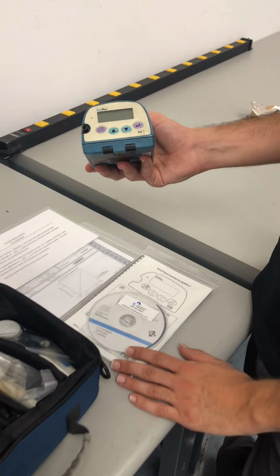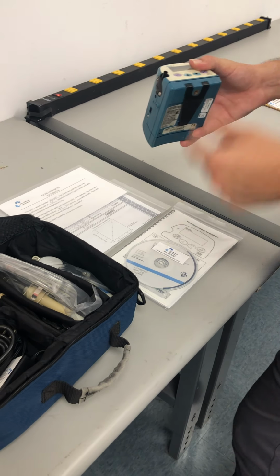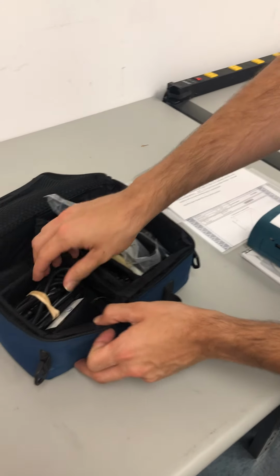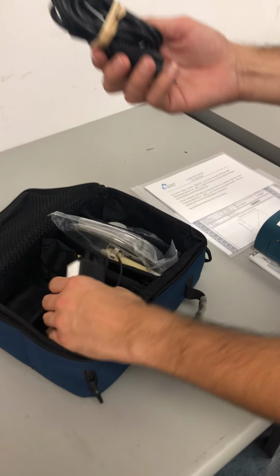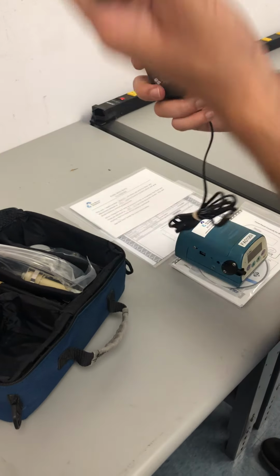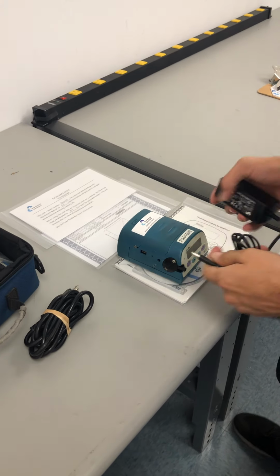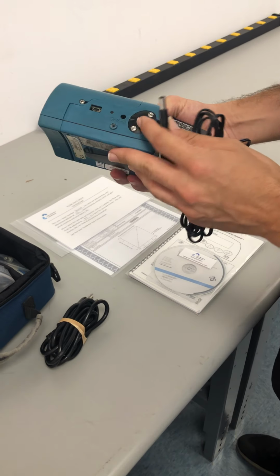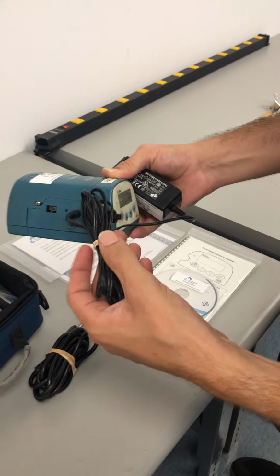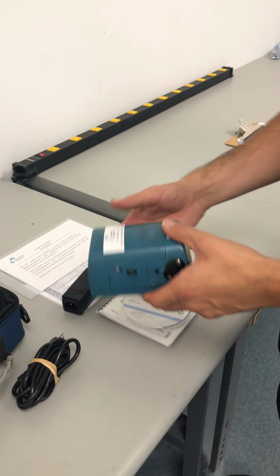What about charging? Okay, so, and also I'll show you how to do a zero calibration if need be. So charging, you have your AC adapter and line cord right in the unit here. Right, so it's just your classic AC line cord. It's got your outlet here, which will go in right behind the impactor. Got it. How will we know when to charge, or should we charge every day? I would say charge every night, yes.